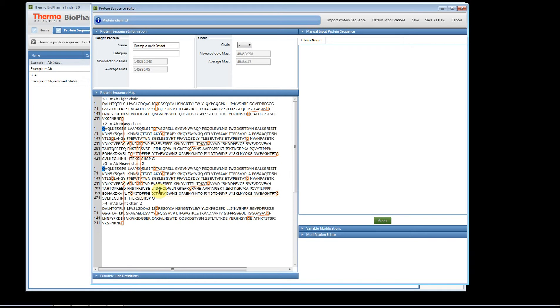Since this is a non-reduced sample, we need to connect all the disulfide bonds. You do this by right-clicking and creating a link, then bridging it to another cysteine. Click on the left side of the cysteine, right-click, choose 'Create Link,' then go to the next cysteine, click on it, right-click, and choose 'Bridge Link.' That connects them together and forms a disulfide bond.